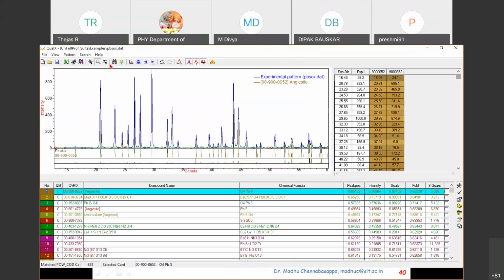Okay, so you can see the time taken by the software. In the previous case, when we did CO2 with the restraints, it took less time. But now without restraints, without constraint, it is taking more time. Okay. So now you can see it is already put.